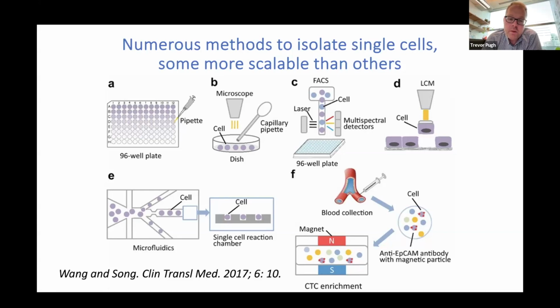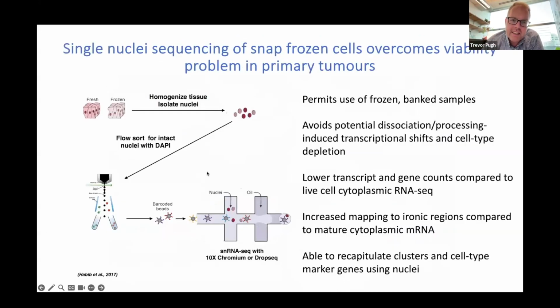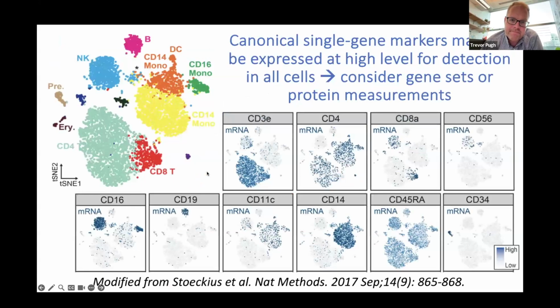So I'd really work through exactly the details, specifically: is there a cellular selection and is there transcript selection? Is the antibody pulling out a cell population of interest? That leads you down one road. And are they actually selecting for individual transcripts in some way? And then is an antibody being used to also add in protein signal as well? So there's a few parameters there. But yeah, happy to take a look at the AbSeq protocol as well.